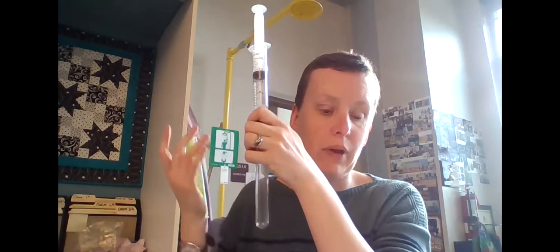So that's our setup. Let's read through the introduction here. In this lab, you'll be reacting sodium bicarbonate with acetic acid, which, if you're watching this video, you're probably going to be watching instead of actually doing it. The syringes are going to be used to capture one of the products. So yes, I've got 5 milliliters of acetic acid in here at the start of my experiment, but when I squirt that into the test tube, it's going to react with the sodium bicarbonate, the baking soda that's in the test tube. And this is going to start expanding, like this. It's going to start really expanding, capturing the gas that is produced in that chemical reaction down in the bottom. So that's kind of what's happening.